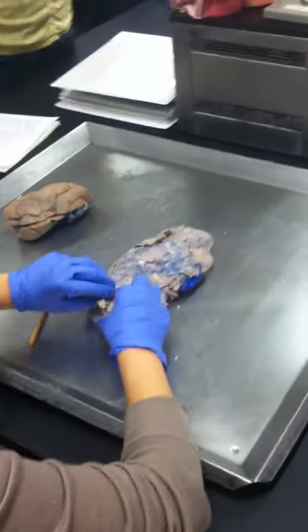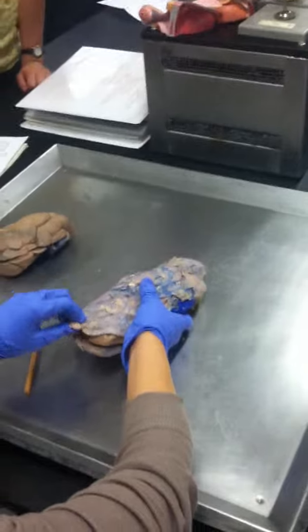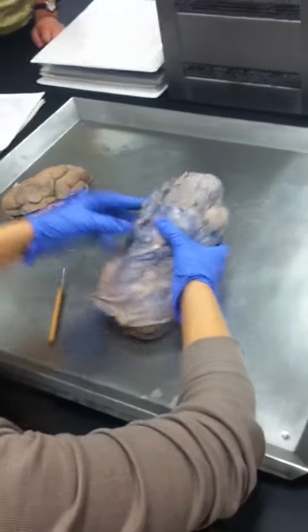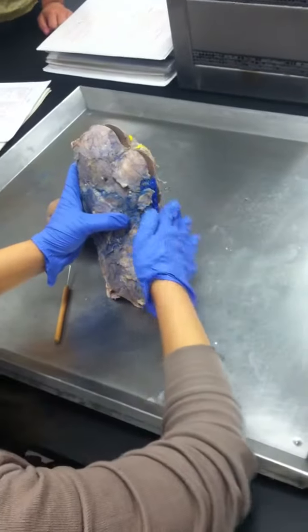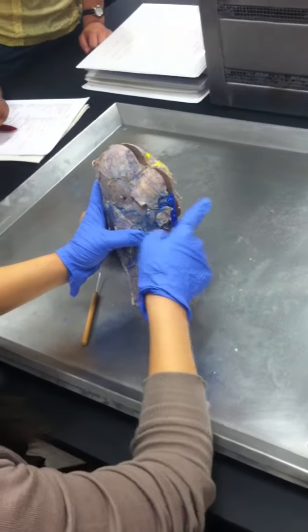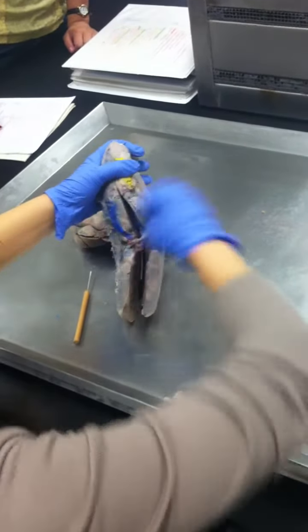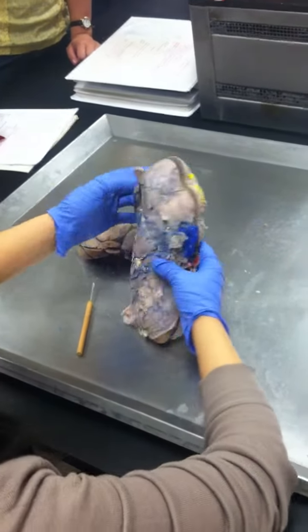See this really thick sheet membrane covering the kidney? What was this called? Renal capsule. Very good. And if you look at, well, let's see, you can sort of see it. There's supposed to be a little indentation, right, to make that bean structure. That indentation is called what? The hilus. But if we were to take everything out and see that cavity, maybe this is the renal sinus, right?